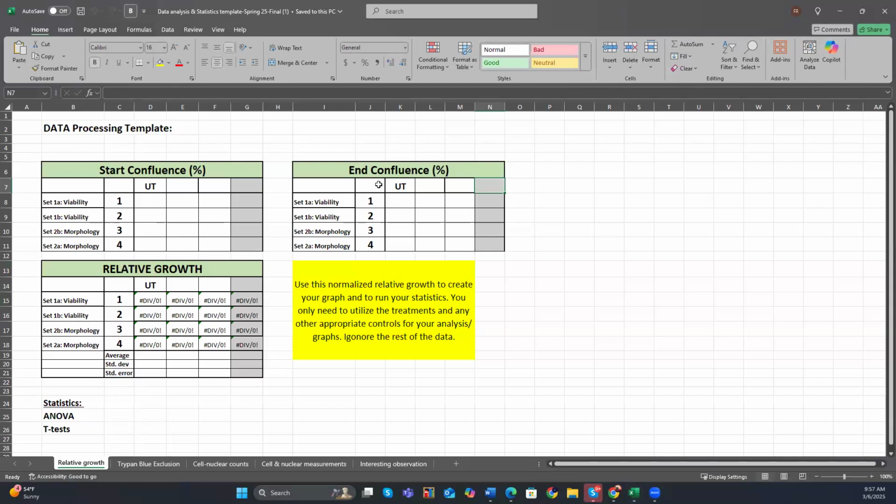If you had numbers that were typed up in the actual document, you should be able to copy paste them. Sometimes when you copy paste, your numbers have some formatting issue which causes it not to work properly. So you may need to fix that, and I can help you. But for now, either copy or hand type the information if they were handwritten notes.